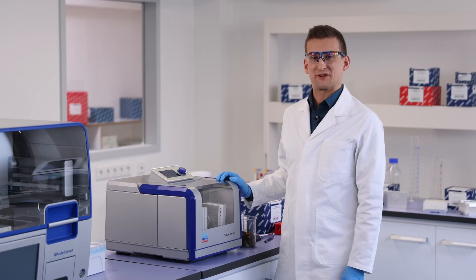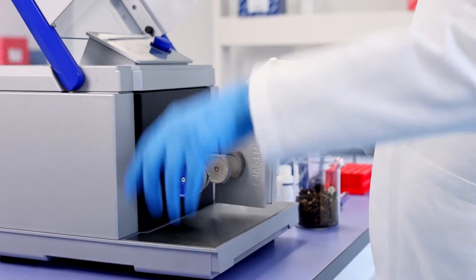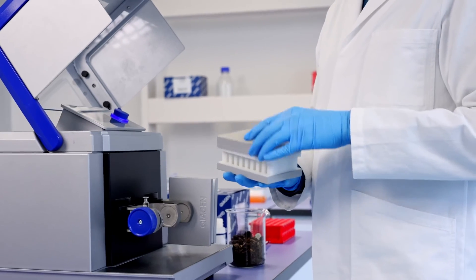Your sample is now ready to be lysed. After the initial run, rotate the plates to allow even disruption of the samples and restart the program. Take out your tube from the adapter.